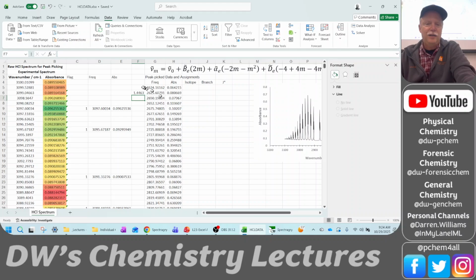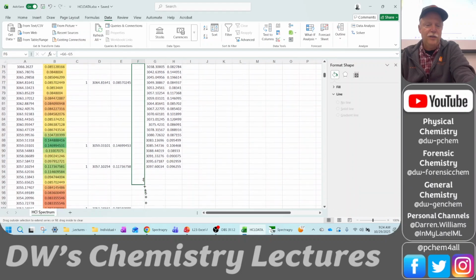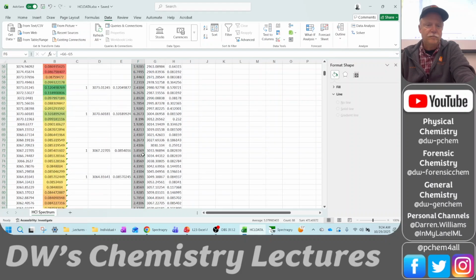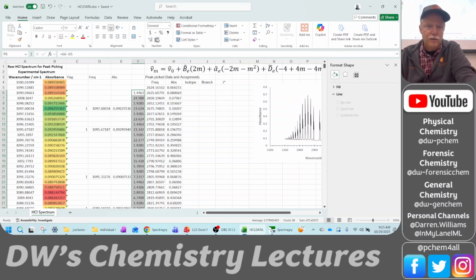So I'm going to take the difference here, and I'm going to copy that down just to see the differences in all of these values. Okay. All right, and so now we're going to shrink those just so we have less to process in our brains. We see a uniform difference here.